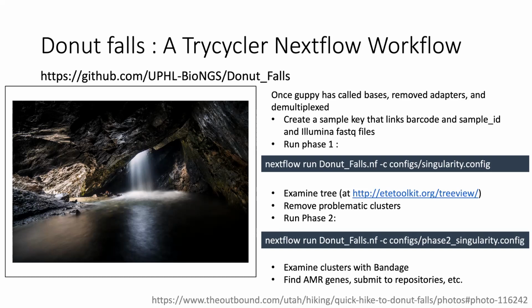But in theory, how this workflow is intended to work is you have an initial run into the workflow. Right now it's set up for nanopore reads, mostly because I don't have any PacBio examples. So we have a GridION, and we have MinKNOW that took care of all of the base calling, demultiplexing, and barcoding, and we create this directory structure.